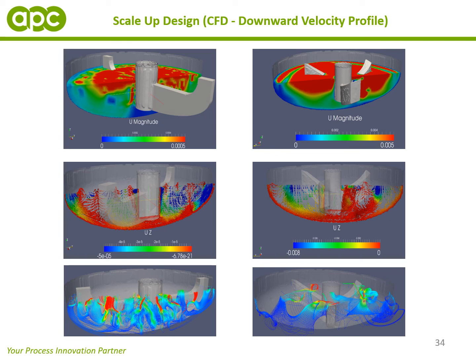And what was identified was that with the anchor impeller, there was probably just a bit more potential for dead zones or regions where the HCl IPA would not be as well incorporated, which might lead to increased meso mixing times, and also possible regions where supersaturation might accumulate, and we wanted to avoid that scenario.